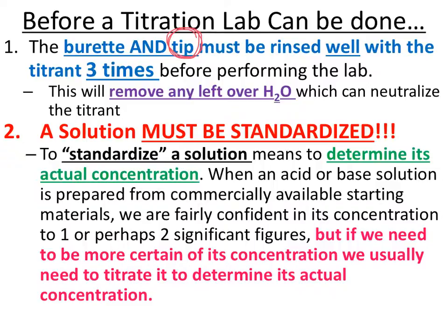Okay? This will remove any leftover water which can neutralize the titrant. A solution must be standardized, and we're going to talk about what standardized means in a second. To standardize a solution means to determine its actual concentration. If you walked into a chemical storage closet and on the bottle it said 0.5 molar NaOH, do you think that bottle is exactly 0.5? Probably some of it's been used. Some of it either has been used, it may have evaporated, something may have happened to it. So standardization is determining its perfect concentration. So you can't say 0.5 just because the bottle says it.